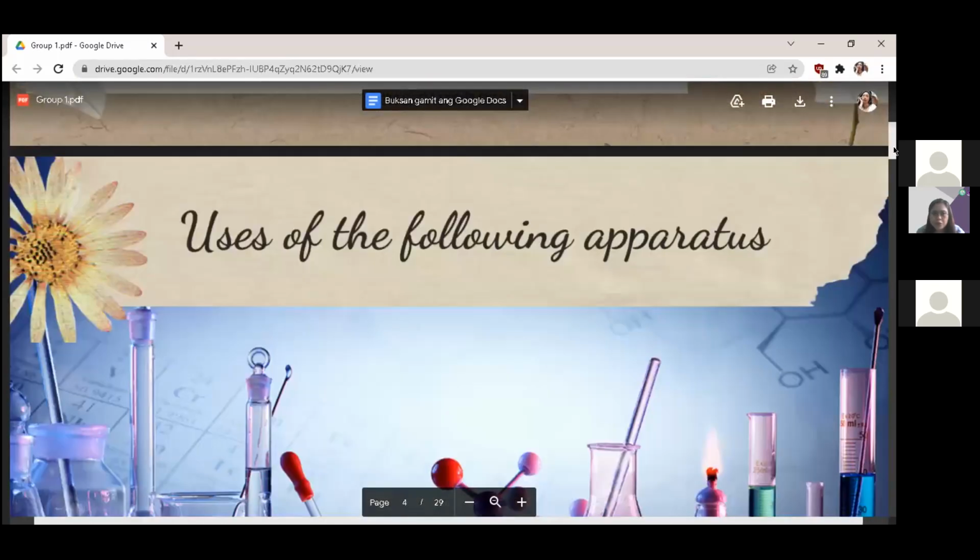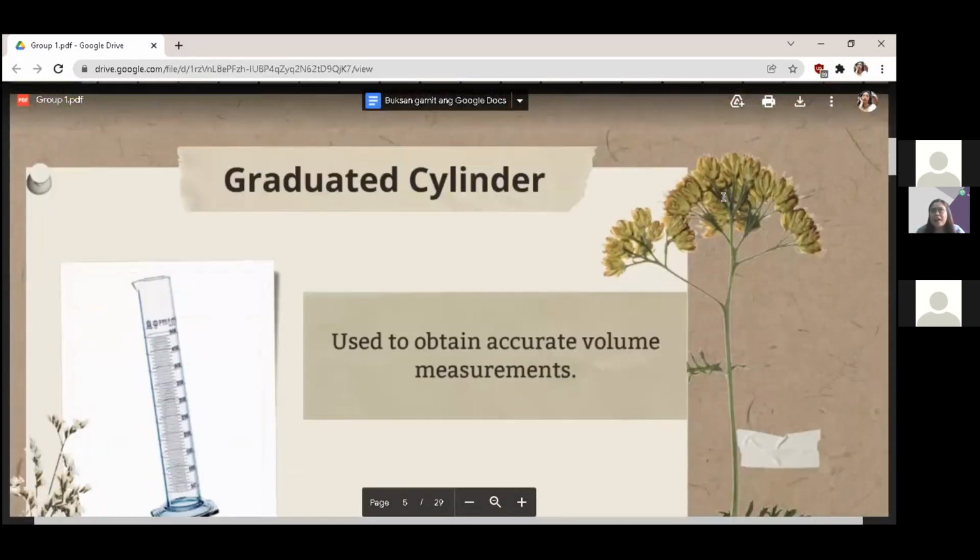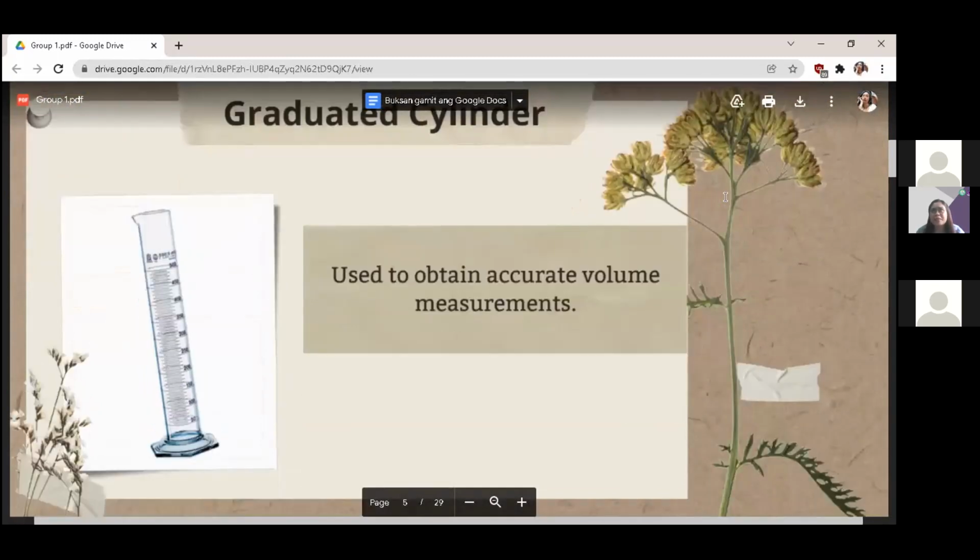From the first one. Okay, this is just a review. I think all of your lab subjects, especially the lower chem ones like this, will really start with the laboratory apparatuses in the lab class. It's for you to be really acquainted with the names of these lab apparatuses and also their uses. There are actually more of them in Chem101 than here in Chem102. But I hope that now, even though we haven't really met face-to-face yet, you are very familiar with them.